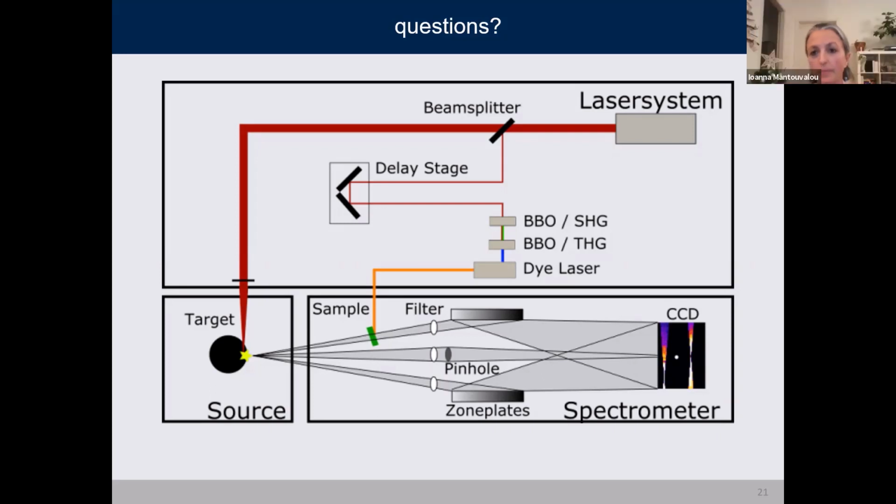More precisely, it's due to the pulse length of our laser. If we go a bit further, we have a very similar setup at the Max Born Institute, where Holger Stier is using a 2 picosecond laser, which is a lot more complex laser system. He can go, I think, to 1.5 or 1.6 keV. I see, a little bit higher. It's a little bit higher.